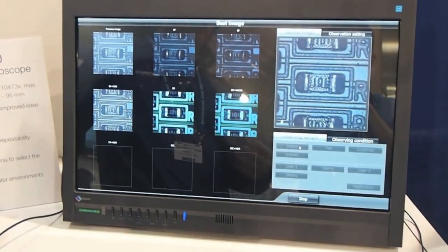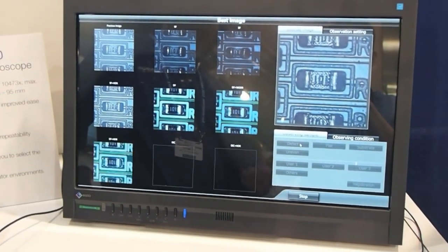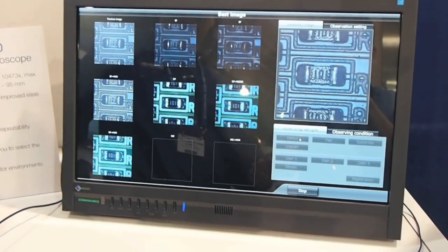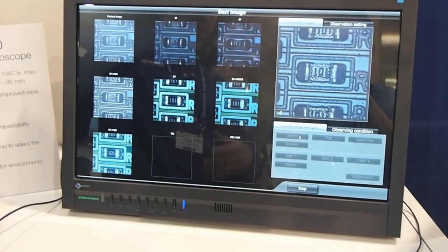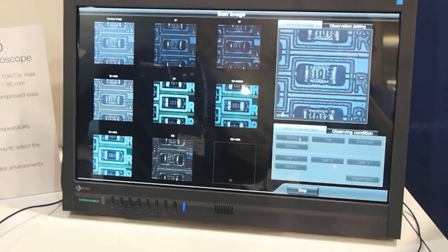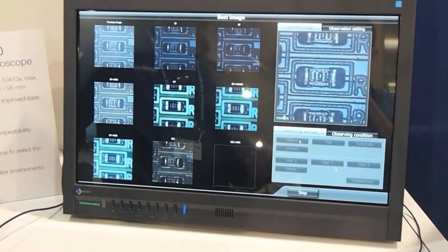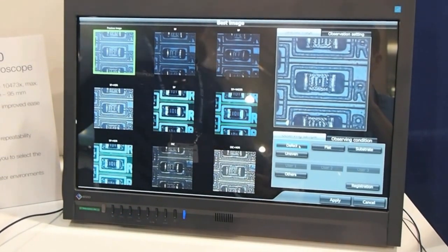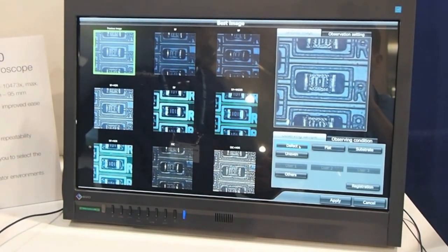It shows dark field with wider anti-halation, dark field with HDR, mixing different modes available including differential interference contrast.